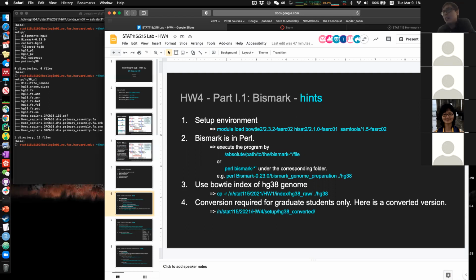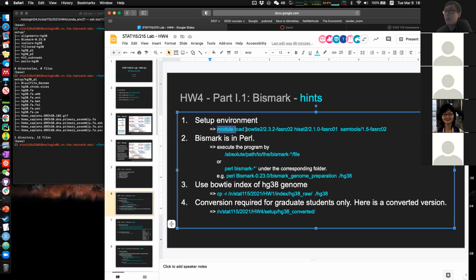Yeah, so first thing we need, as we needed before, is some alignment tool. So we use this Bowtie indexing file. I think we used them before, so we are going to use that again. Since we are using this Canon server, well, apparently you can use your local machine, but we recommend you use the Canon server.